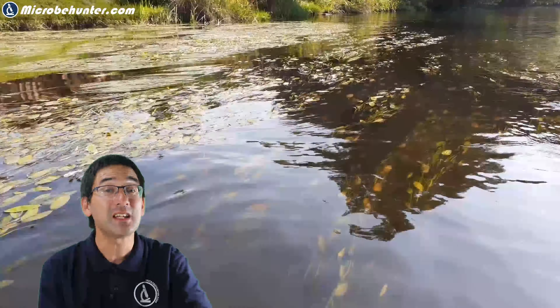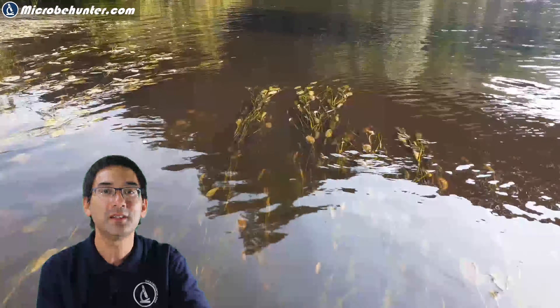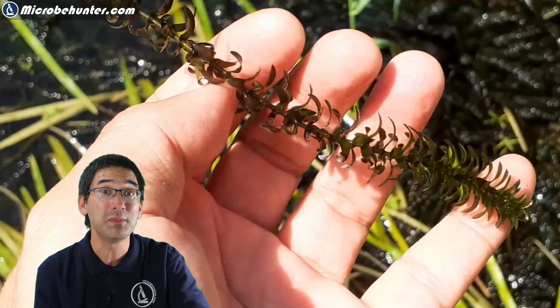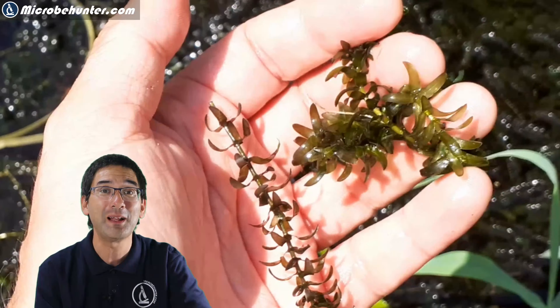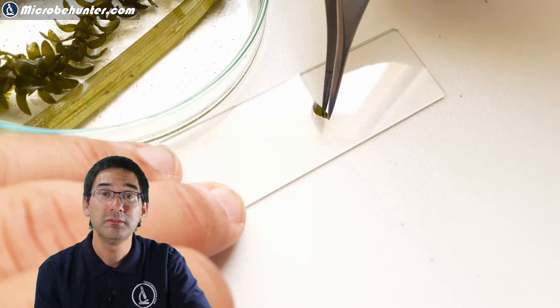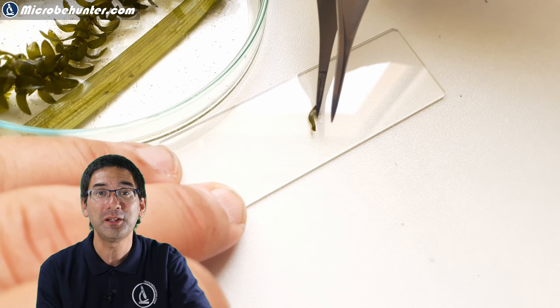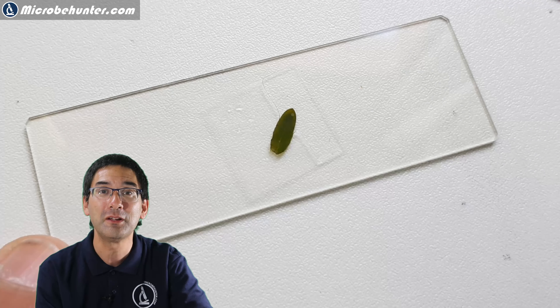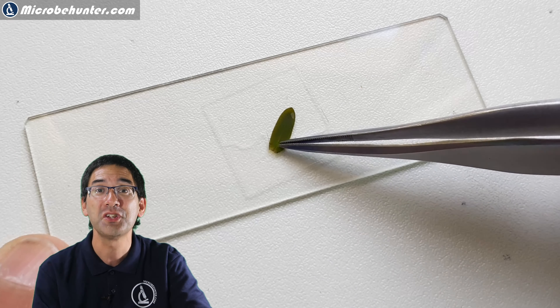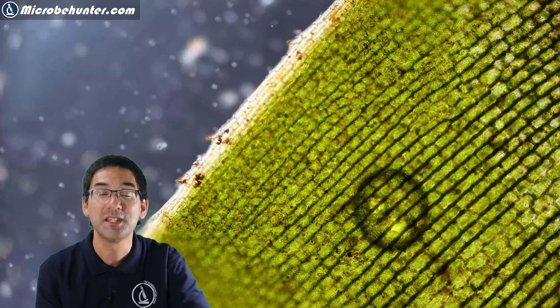The water itself was extremely clean, which is actually a sign that there seems to be relatively low organic content. One reason for this is that the rapid growth of those water plants keeps the water relatively clean. This is Elodea — I put Elodea also under the microscope. It's a very popular and common specimen to observe because the chloroplasts are quite nicely visible.